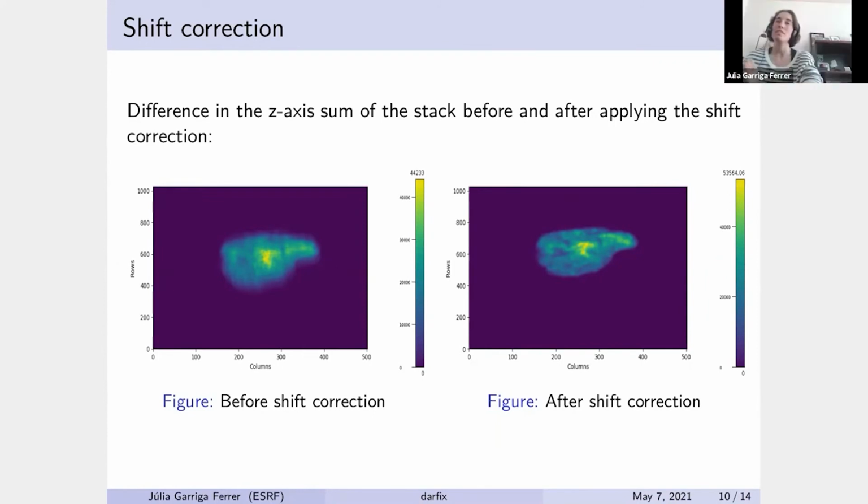Yeah, it's actually the linear shift. So what I look at is just how the shift evolves through the data set. To find it, I tested several different methods, because as performance evolves, time also takes more. So what I ended up doing is an easy shift between the first part of the dataset and the second part, and then update it to find the optimal shift between those two. So basically, I just sum the first part of the dataset and the second part, find the shift, and then update it by changing some parameters, which works very well and it's very fast.